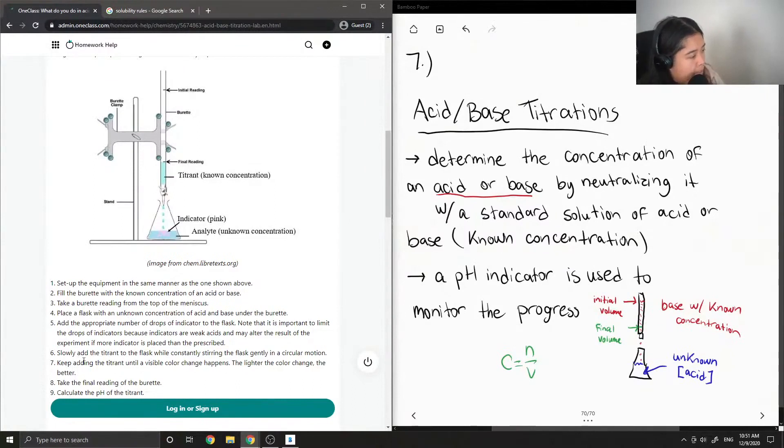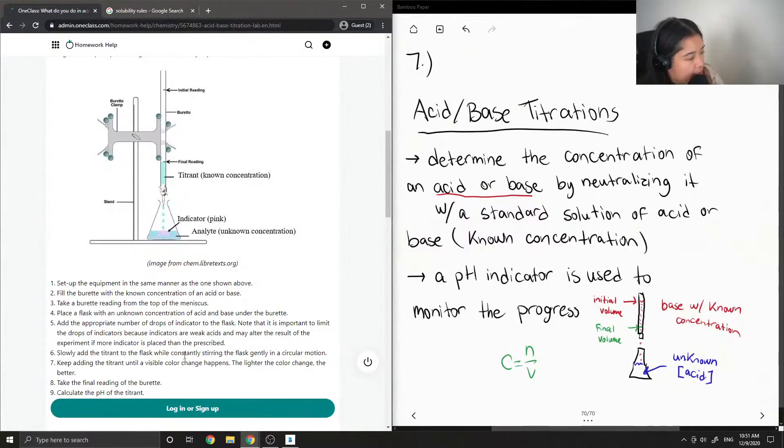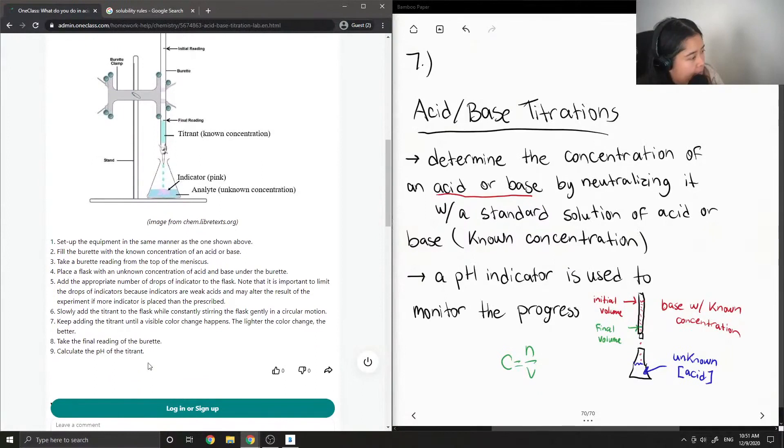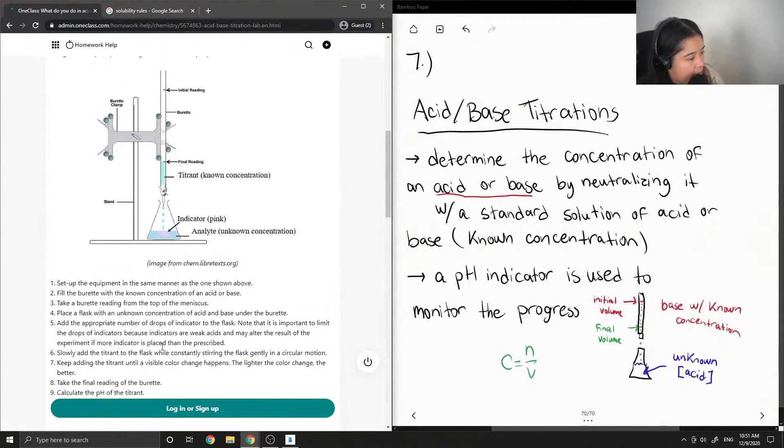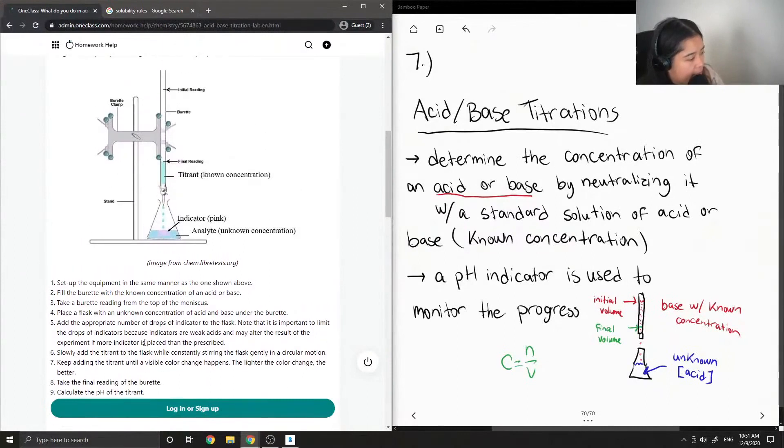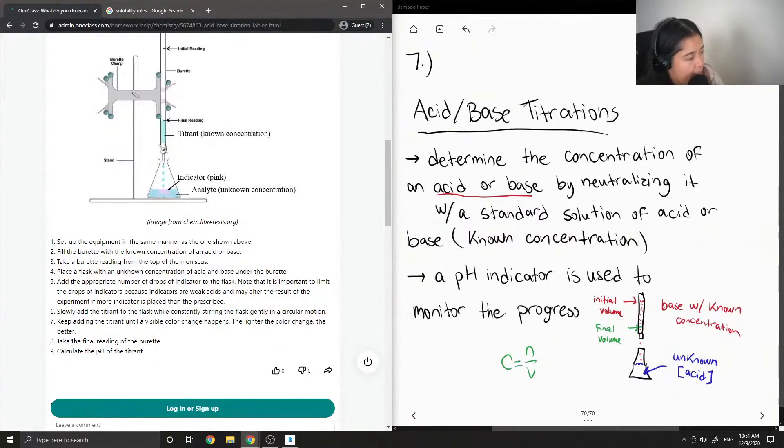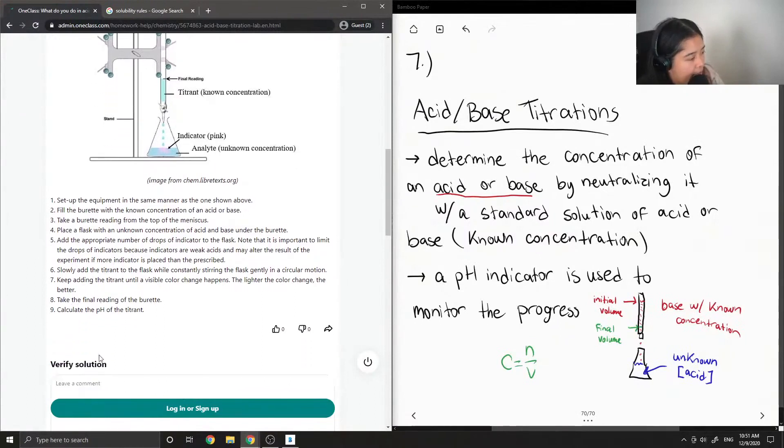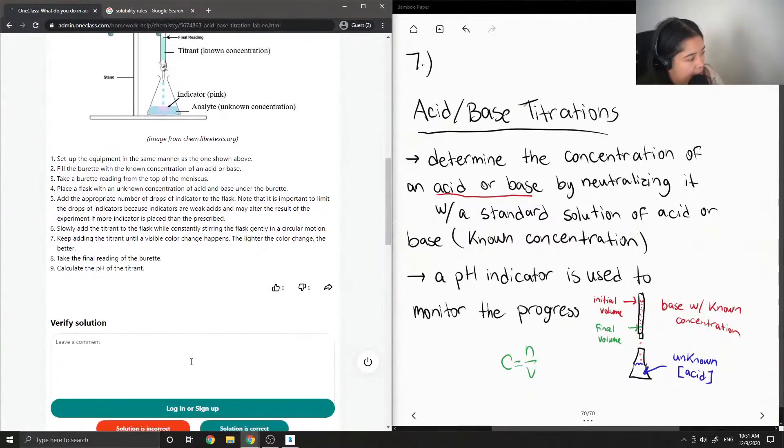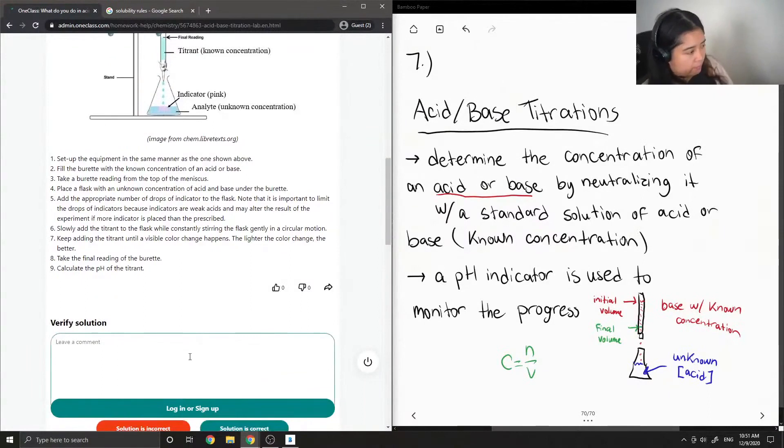Six: slowly add the titrant to the flask while constantly stirring gently in a circular motion. Seven: keep adding the titrant until a visible color change happens—the lighter the color change, the better. Step eight: take the final reading of the burette. Nine: calculate the pH of the titrant.